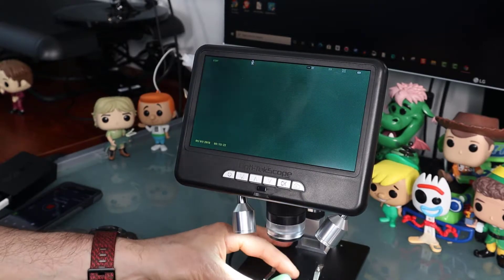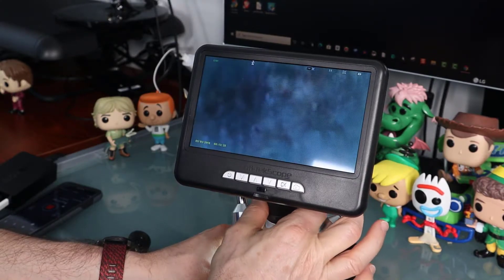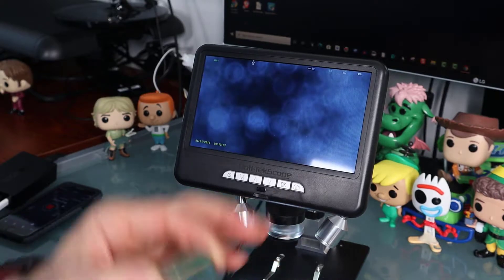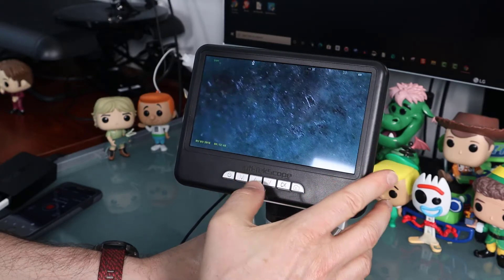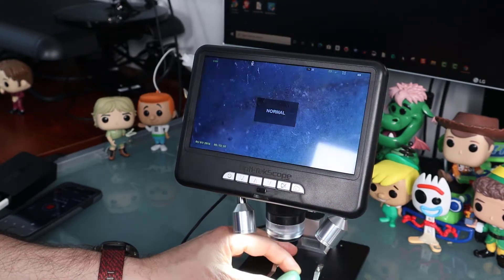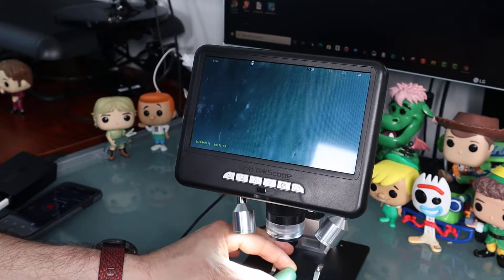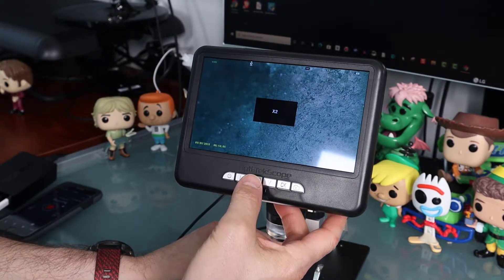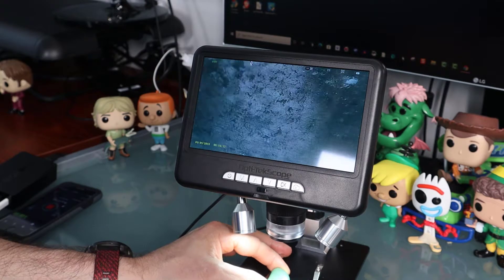Next, a green rock — let's see if we can uncover something here. That gives you an idea of this green rock with a nice close up. That is zoomed all the way in. If we go back out, times two, and this is normal. You can really get in there and see some detail. Flipping to the other side and zooming in — pretty cool. You can really see a lot of little crevices within the rock.